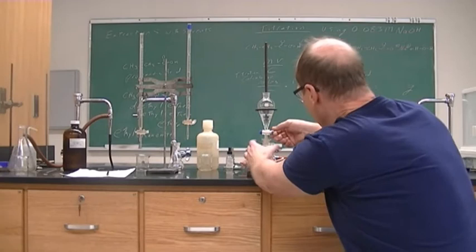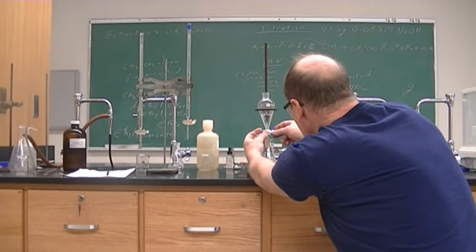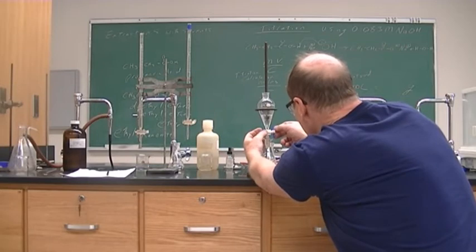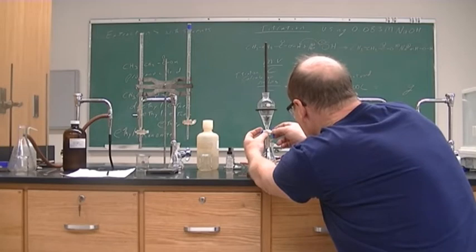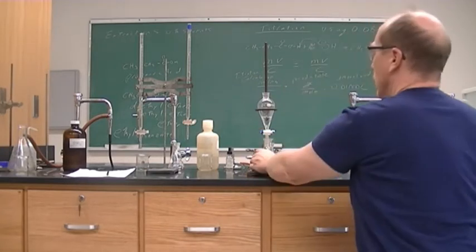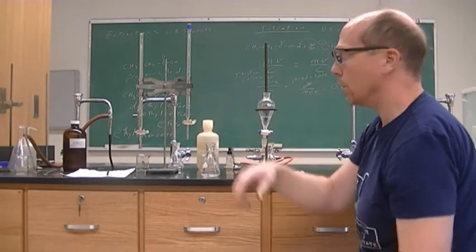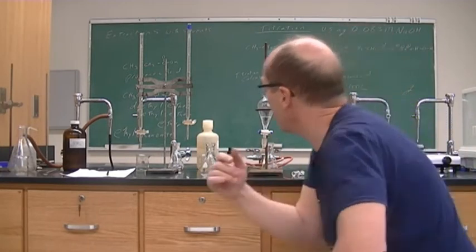So we're going to take off the bottom layer. When all of the aqueous layer is in your Erlenmeyer flask, you're ready to do another titration.